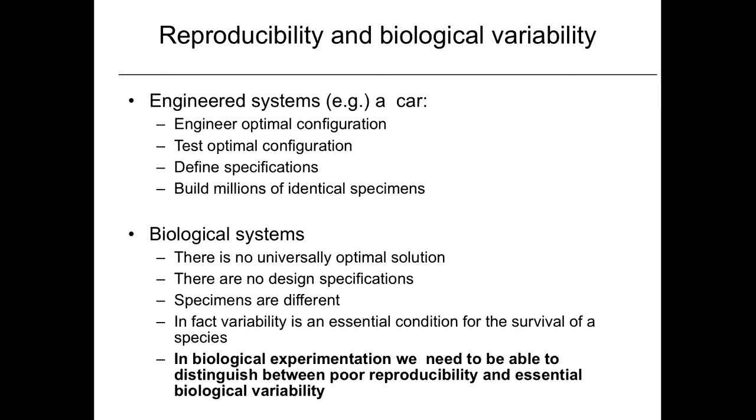So now I would like to make a general comment about the issue of reproducibility and variability. We try to make measurements that are basically the same when we do them again. So if two groups do an experiment, let's say on a cell line or a mouse or a yeast strain, and do the same measurements, we think there should be no variability. Of course, this is not possible, because there's always some technical variability, but we would like to say that if two people do the same experiment, and the technical variability is under control, they should come up with the same results.